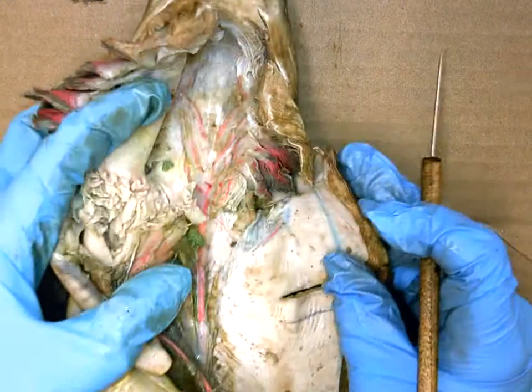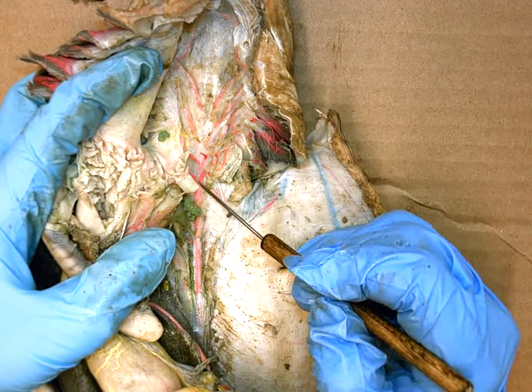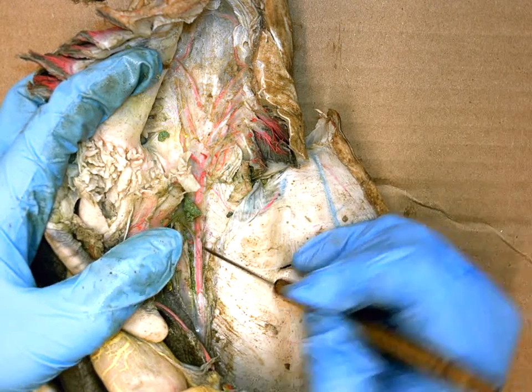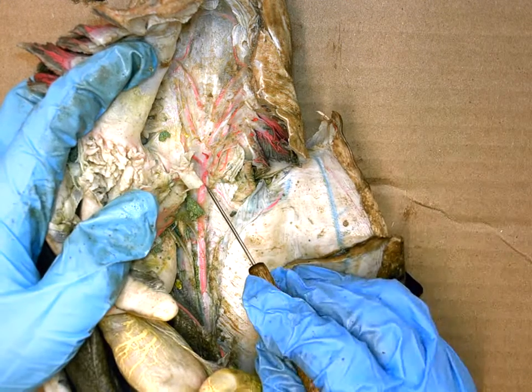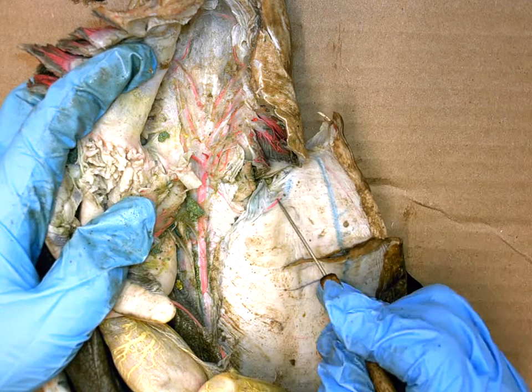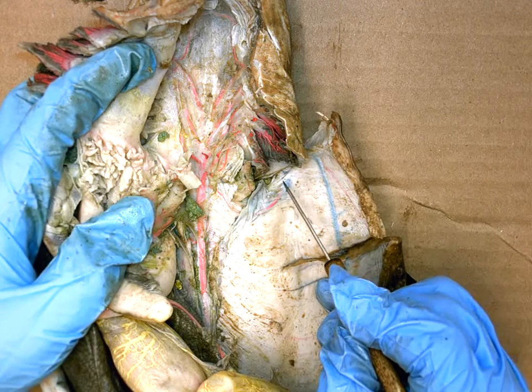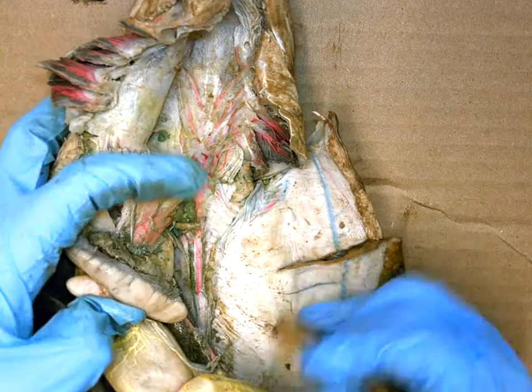Going down further, once all the efferent brachial arteries unite, we are now on the dorsal aorta. The dorsal aorta has a first branch that comes off in a U shape, called the subclavian artery.